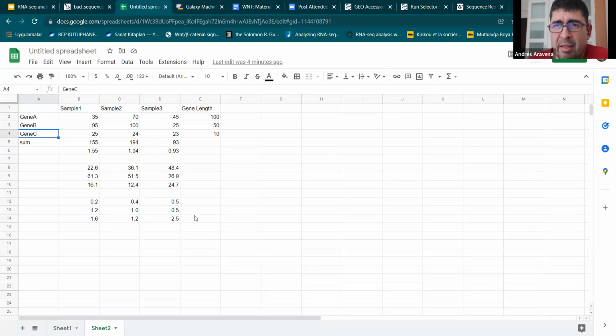I think we can try, but in this formula they give you the same number, because you are dividing by the two things at the same time. If you see the result in, let's say, B12, at the end of the day it is essentially B2 divided by B6 and divided by E2.